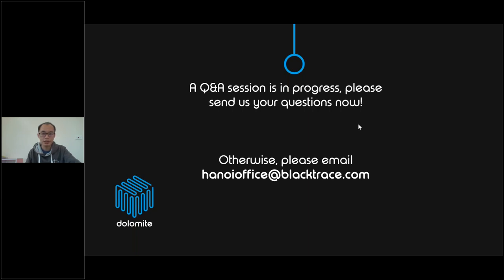So what is the role of surfactant and how does it affect the stability of the droplet? The role of surfactant is just for stabilizing the droplet. As you know, the surfactant itself has two ends: a hydrophobic head and a hydrophilic one. So when using surfactant with droplets, the surfactant will prevent the droplets from sticking to each other, so it keeps the droplets more stable. So after the droplet generation, it's very helpful to use the droplet surfactant or emulsion stabilizers for stabilizing the sample after the formation with the microfluidic method.